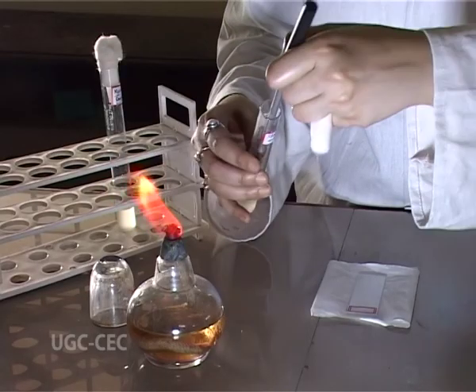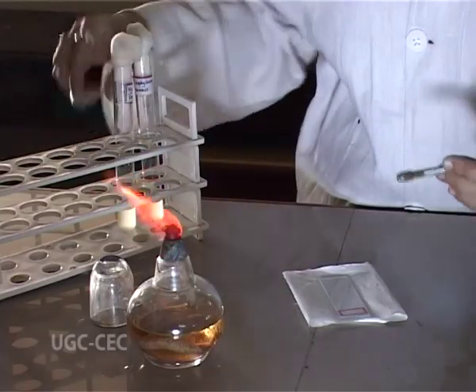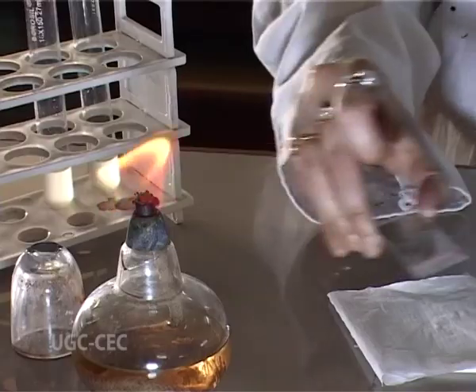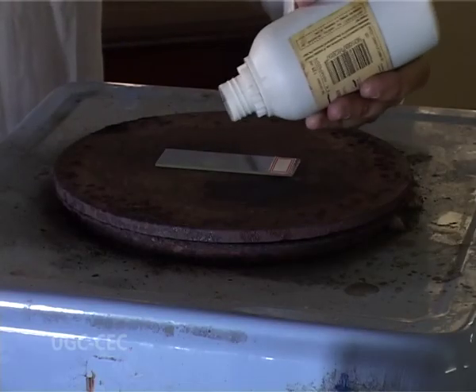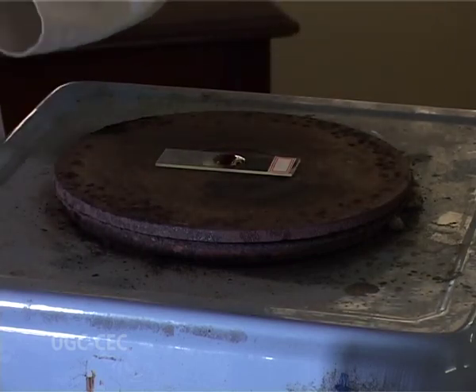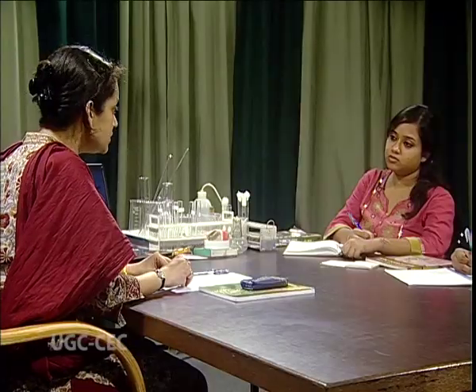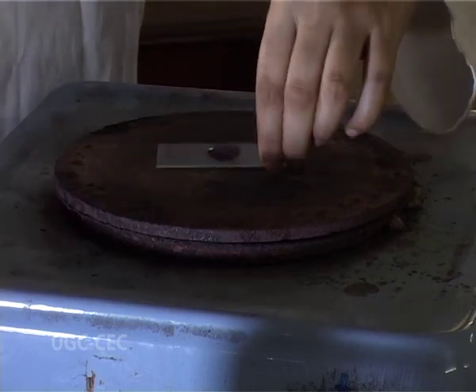We make a mixture of Mycobacterium and Staphylococcus aureus culture on a clean grease-free slide. We allow the smear to become air dry, heat fix the smear, and then flood it with carbol fuchsin on a hot plate. Heating is applied during the application of primary stain, in this case carbol fuchsin, to facilitate the penetration of primary stain into the cytoplasm of bacterial cells. Then we keep it for 3 to 5 minutes on that hot plate.